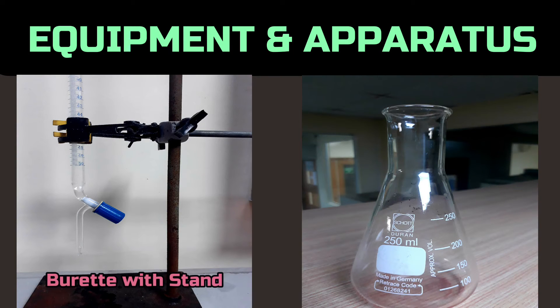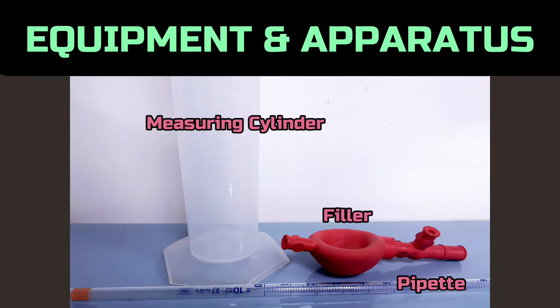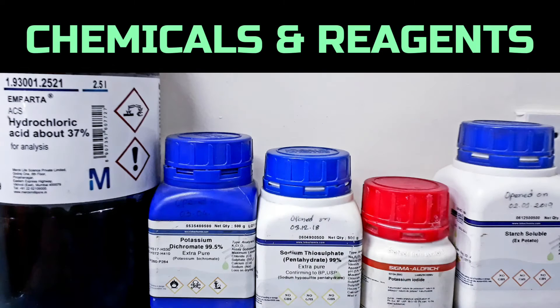Among the apparatus and chemicals, we need a burette with stand, conical flask, pipette with filler, measuring cylinder, concentrated hydrochloric acid, potassium dichromate, sodium thiosulfate, potassium iodide and starch.